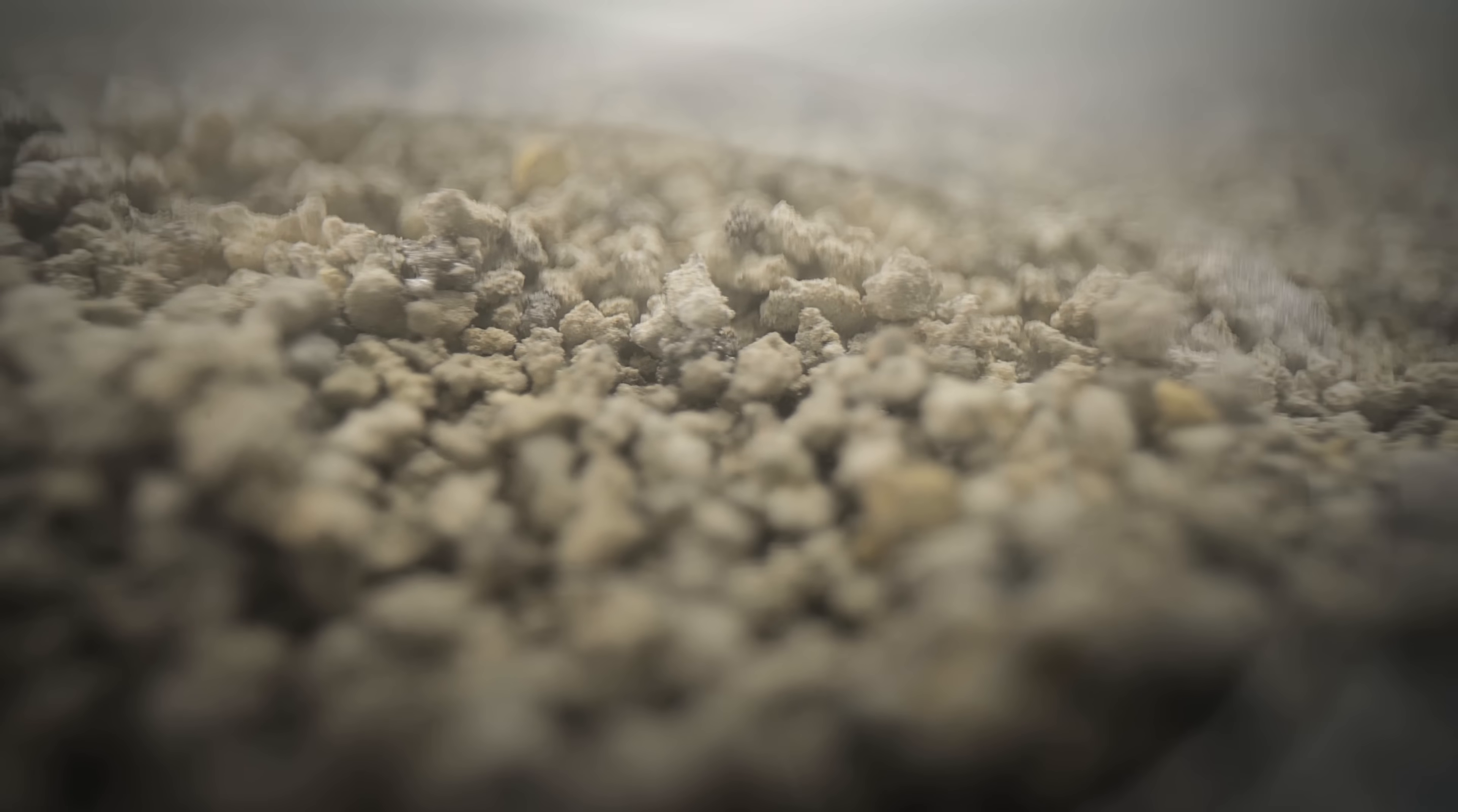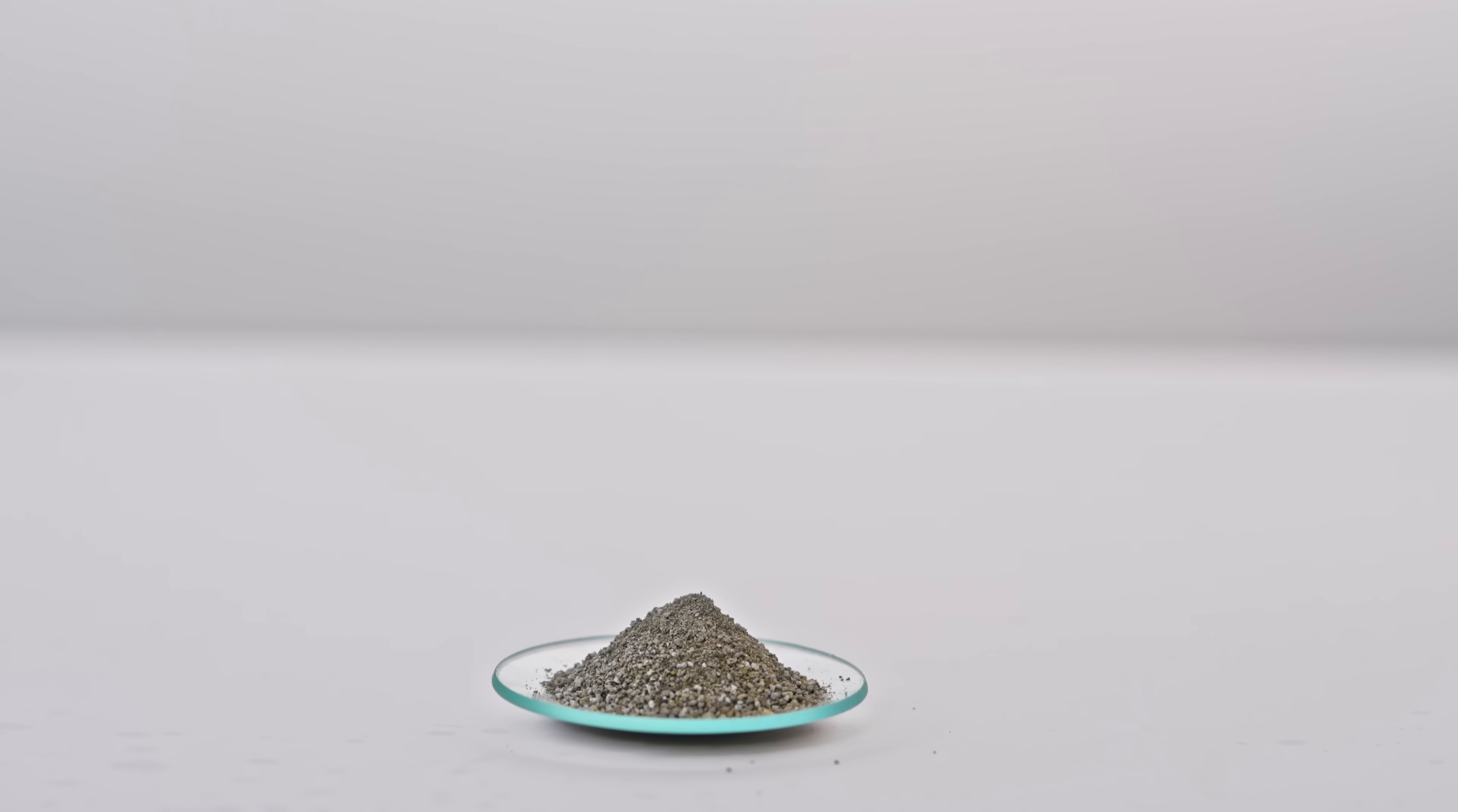This can be detected by bringing a piece of paper soaked in phenolphthalein near the powder. The paper quickly turns a crimson color.